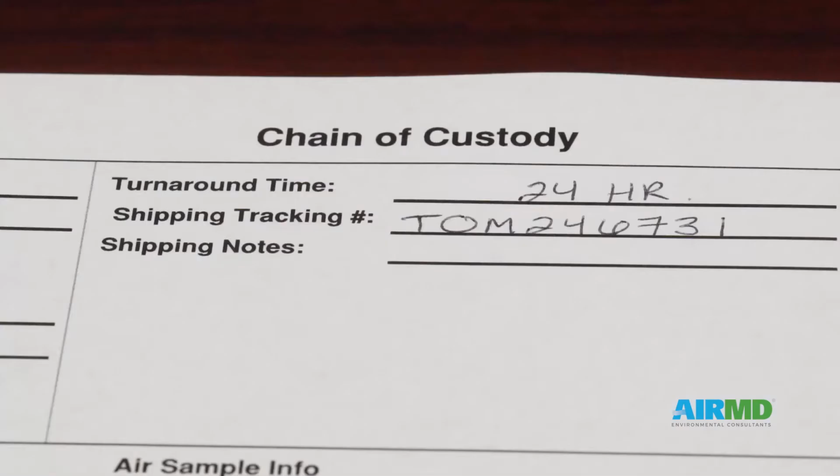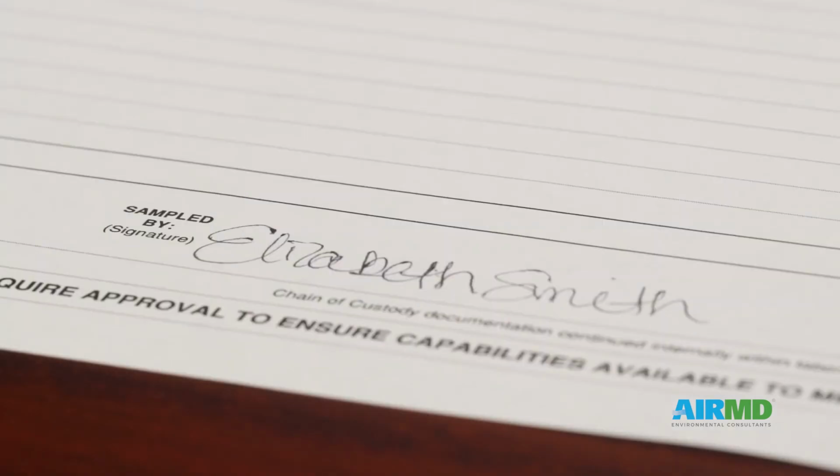Make sure the chain of custody has a relinquished signature prior to shipping the samples to the laboratory. For directions on how to complete a chain of custody, please refer to the AirMD chain of custody video.